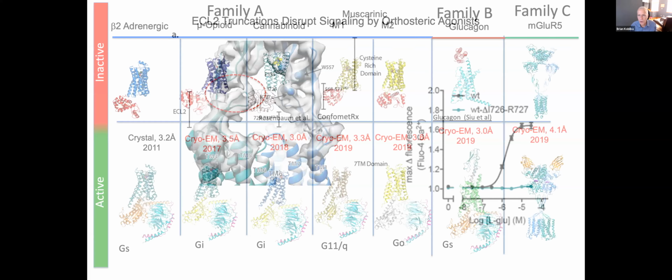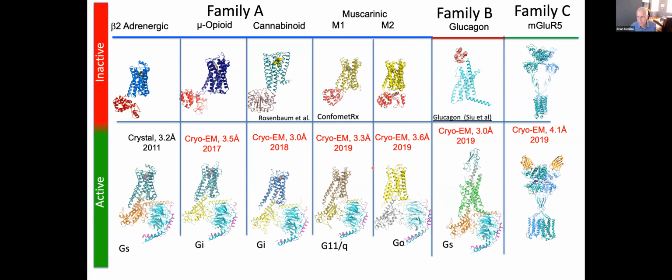So that's sort of the end of my tour of cryo-EM and its huge impact on the GPCR field. Now we largely will only use cryo-EM when going after active state structures. Inactive states without the associated G protein are still a challenge because of their relatively small size and the micelle. However, with tricks of protein engineering and antibody fragments, it's looking more likely that we'll also be able to get inactive states. And this is, again, a really important advance for drug discovery because pharmaceutical companies can now rather quickly identify the location and interactions of their favorite agonist or modulators to their GPCR targets.